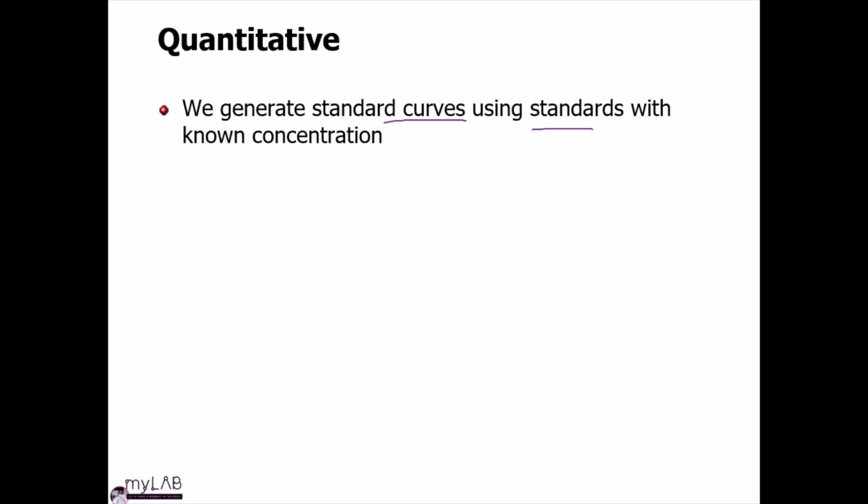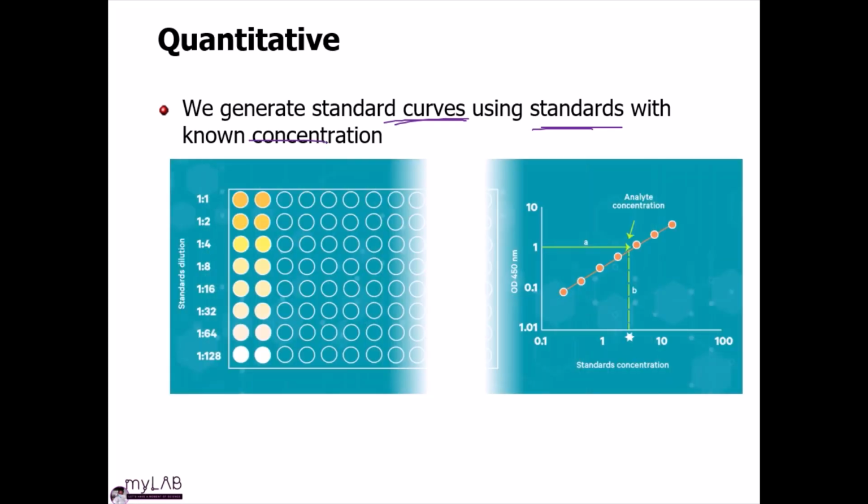For quantitative results interpretation, we generate standard curves, and for these standard curves we use standards that have known concentration.